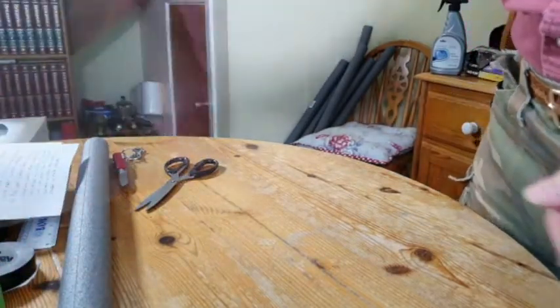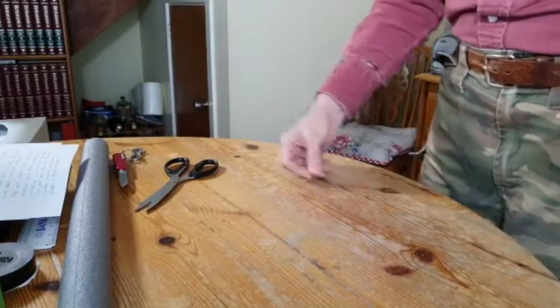Making the visor. One, take one sheet. Make sure you've only got one. There's two there. That's it. There we go, one sheet. Lay it down flat.